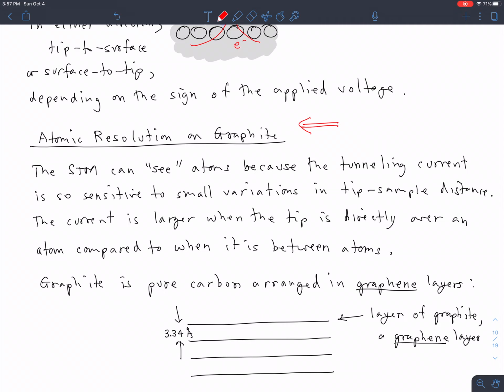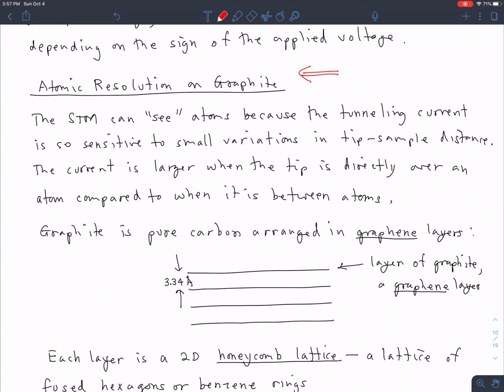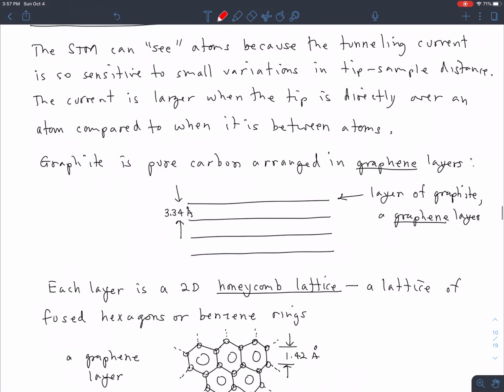And that's graphite, which is, of course, elemental. It's the most stable form of elemental carbon at room temperature and pressure. So it is elemental carbon in its most stable state. This is the type of carbon that gets a free energy value of 0 or a delta H value of 0 on all those thermodynamic tables that you've seen since you were in freshman chemistry.